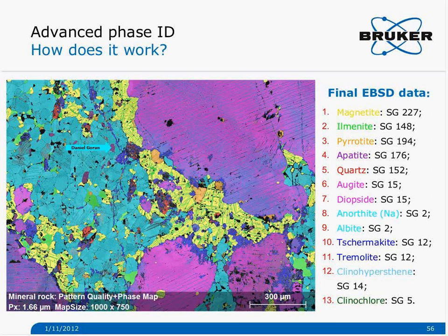The Bruker software allows you to save data in a text format, which is compatible with the 2 other main EBSD systems. It can export the data in that format, but you can also import the data in that format, which means you can load EBSD data sets acquired with the other EBSD systems.